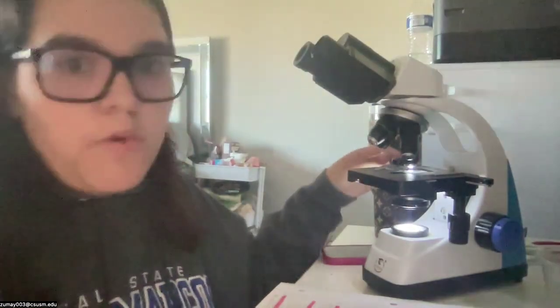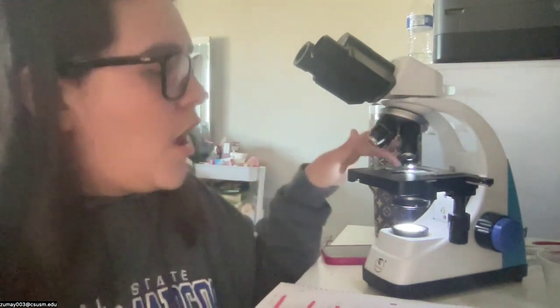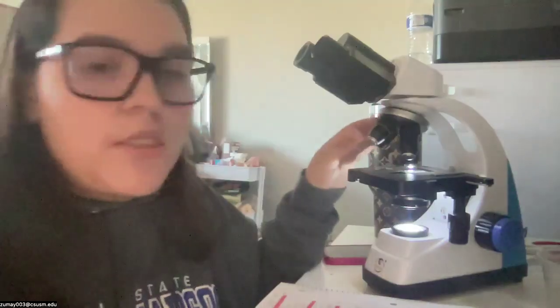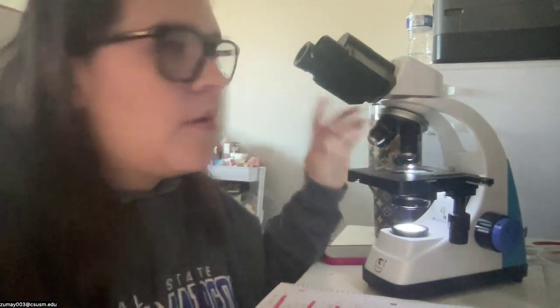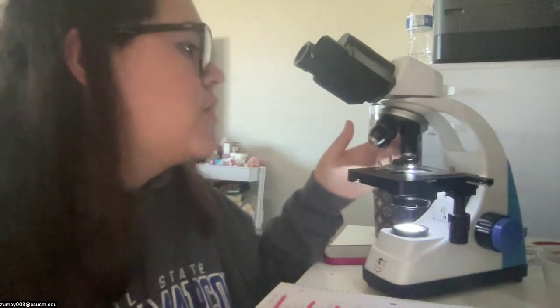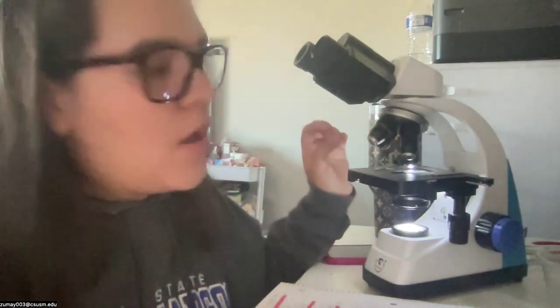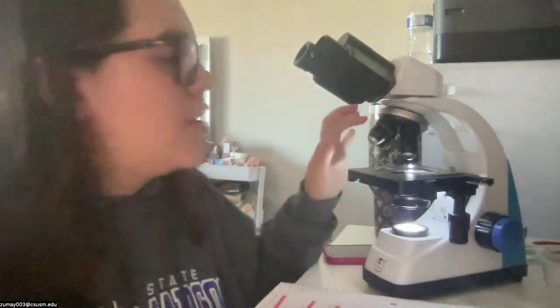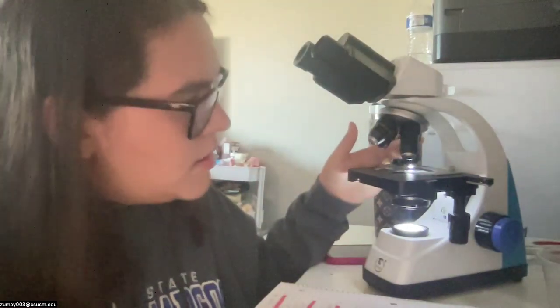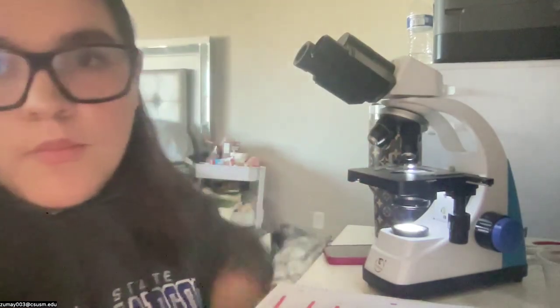Once the oil immersion lens is there, you are going to lower your stage, put 1 drop of immersion oil in the center of the circle, and then raise your stage to be able to see the slide. Then you will use the fine focus knob to sharpen the image so that you can see it. You want to make sure that you are not submerging your lens inside of the oil.